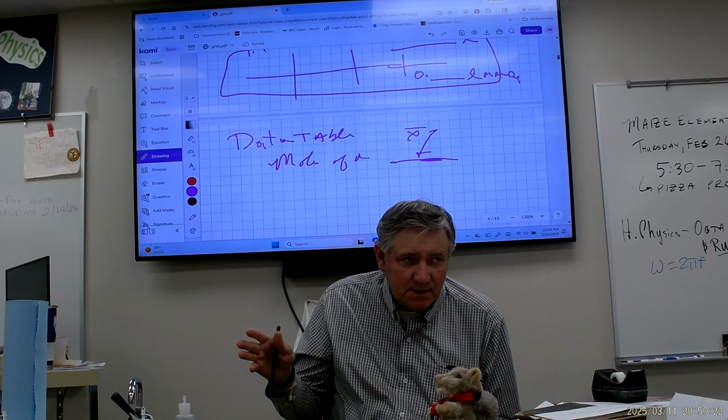So, you're just obtaining 60 milliliters, and then from that, this is where you can use that 25 milliliter volumetric pipette with the bulb, because you know you need 25 milliliters of this stuff. So you could use that volumetric pipette on that one, or you could just use a graduated cylinder, whatever works for you. But again, you're going to put that in. You're going to add 10 milliliters of the sulfuric acid.